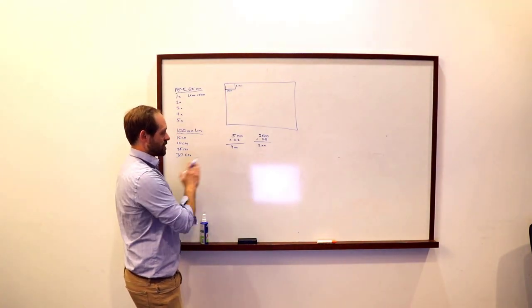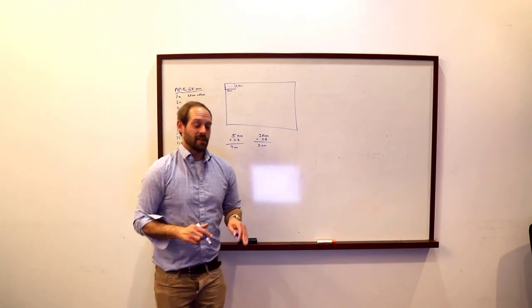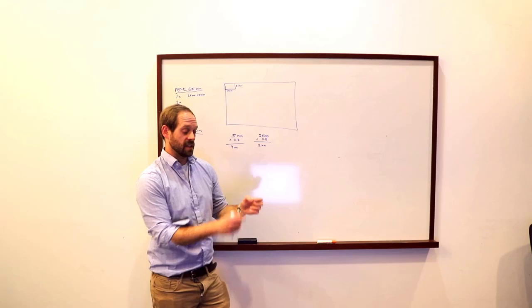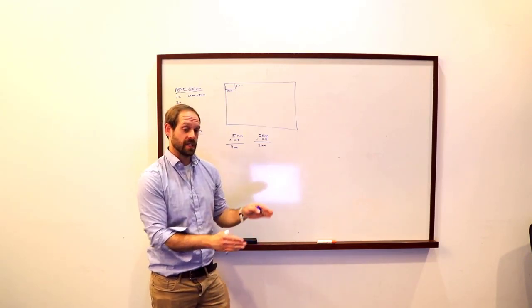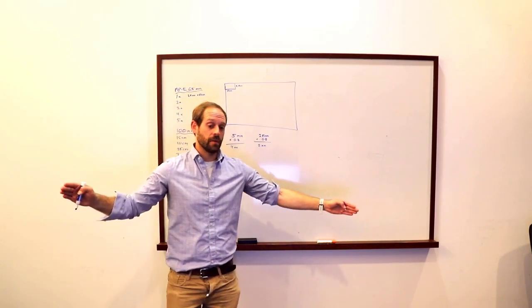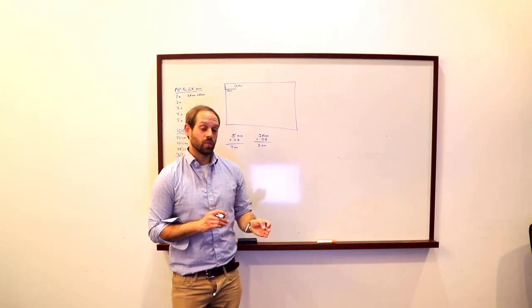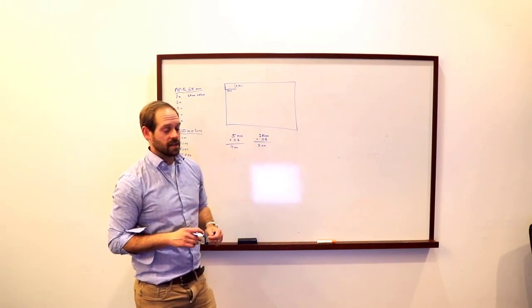Okay, so remember, this is what we're talking about as field of view. What sidetracked me is that the rail systems, which are different than the stack shot sliders that only move a total distance of either 10 or 20 centimeters, are moving a full meter, and they move at a different rate. That rate needs to be understood in order to modify these lengths.